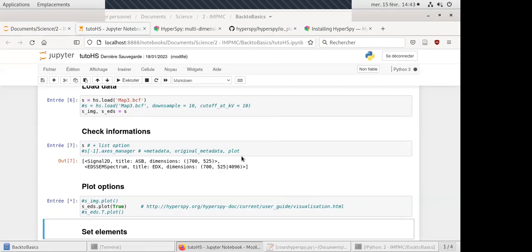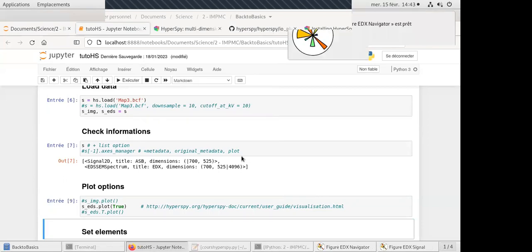It's a slow computer so it reads the scale from the BCF — yes, the scale is digitally written in the file. Just be careful that you have proper communication with the scan stage calibration. For example when I coded the GEM part, I could read the scale written by the analysis station, but the stage was not calibrated, so the scale is totally different from the corresponding images.